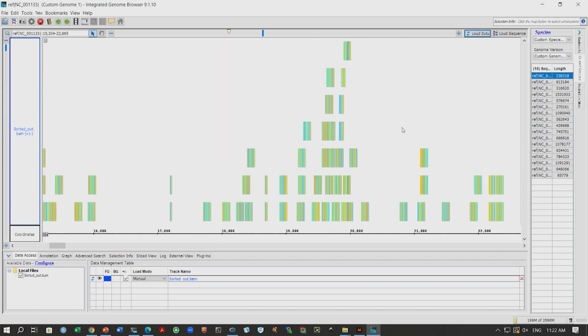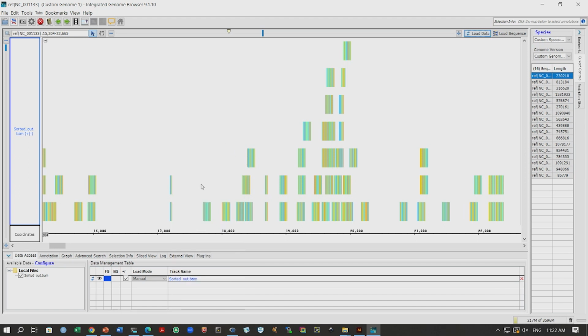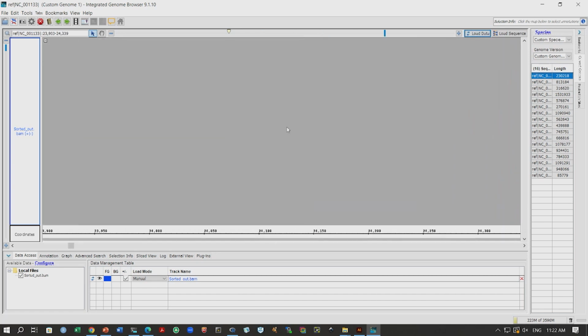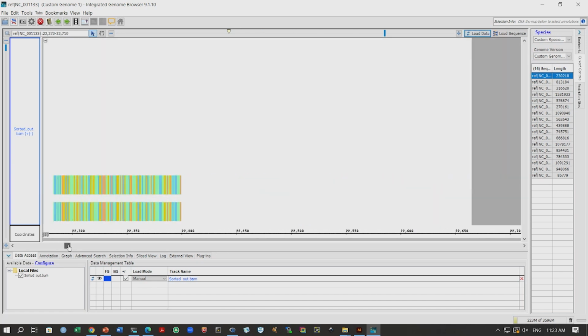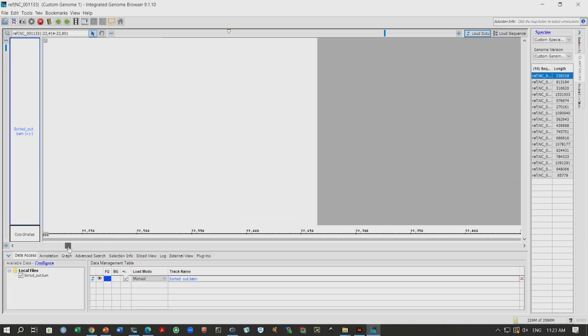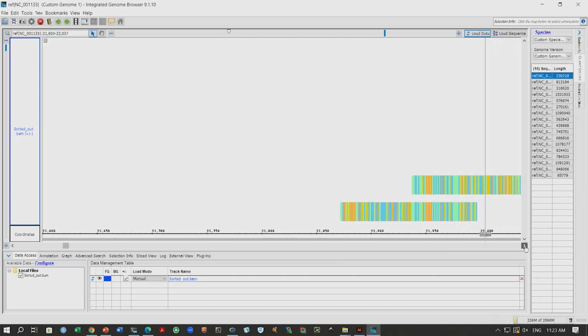What you see now is very interesting. Here you see the read mappings. Each of these bars is one read, and you have multiple reads mapping to one position here. We can also zoom in further, and you can now see these reads in much more detail. There you see different colors because these are the bases that have been colored differently. You might be wondering why this is so sparse. For some regions there is no read mapping at all.